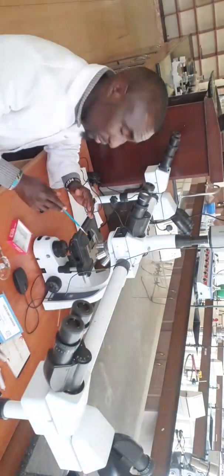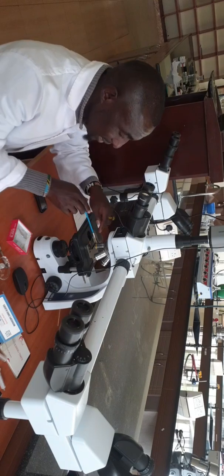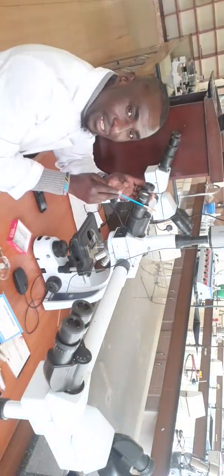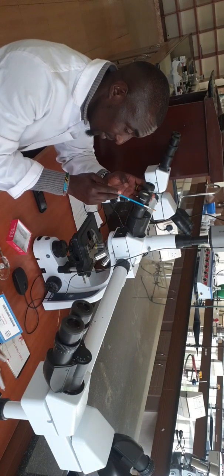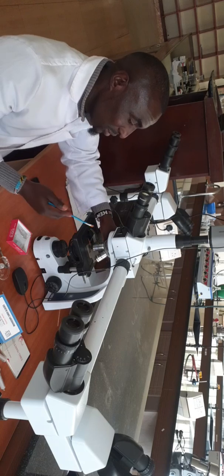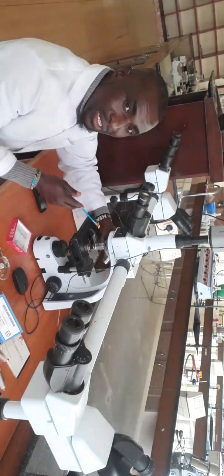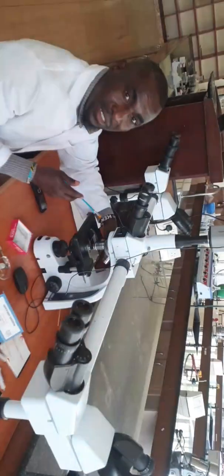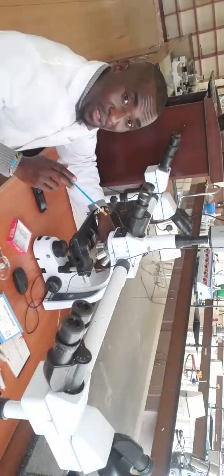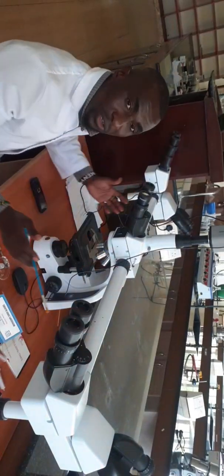When you are working with a times 10 objective and a times 10 eyepiece, magnification will be times 100. And that's how it goes up to times 1,000 when using times 100 times 10. So that's the technique of how to use a microscope and the parts involved.